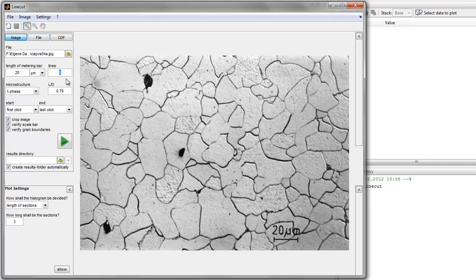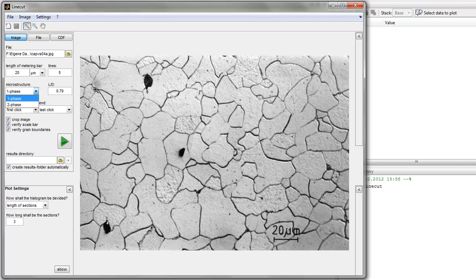Then you have to choose how many lines will be put over the image when we start. Microstructure means this is a one-phase microstructure with only one kind of grains. So when you click on a grain boundary it is the left border of this grain and also the right border of this grain. If you have a two-phase microstructure, you have to click on the left and the right border of each grain.